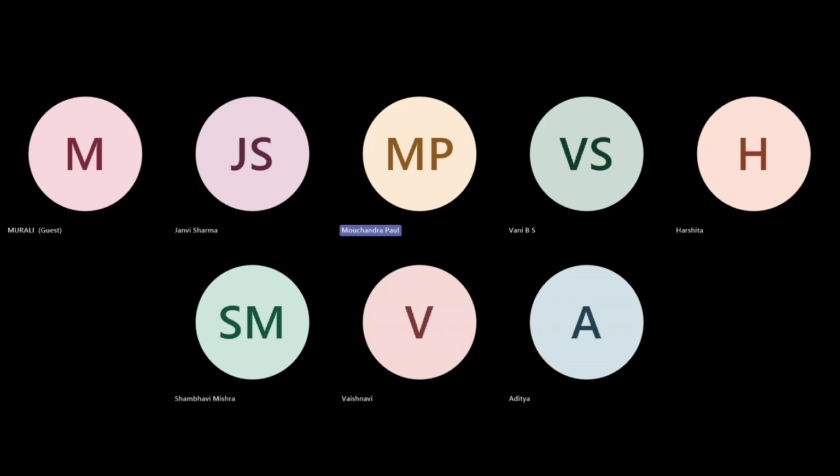On the hemocytometer, a 5 by 5 matrix is there, and this matrix can be divided into 4 quadrants: 1, 2, 3, and 4. So these are the 4 quadrants. This is the hemocytometer device, and on the device these quadrants are etched. Under the microscope you can visualize where the lines are.